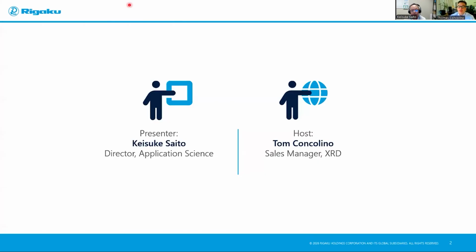This is the fourth and final episode of our Practical XRD with Confidence series, and today we'll be exploring nanostructure with SAXS, WAXS, and X-ray reflectivity. Please note, if you missed any of the previous webinars, you can view them on the Rigaku website.